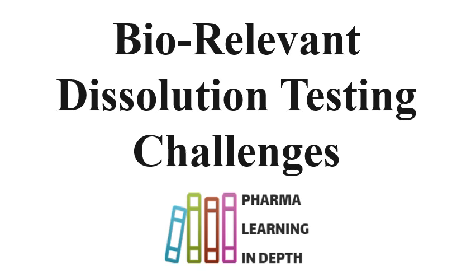It requires deep understanding and customized tests for specific patients. Then there are limitations of the current methodologies and standardization difficulties. Then dissolution media development is another challenge. So this is the information on challenges in biorelevant dissolution testing.